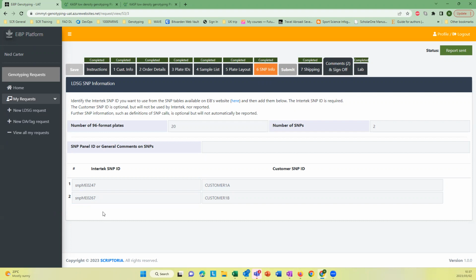But then in case of mid density, it will be difficult to upload the huge number. No, for mid density, you don't want to upload all the SNPs. You just want to select the mid density panel name so that the vendor will do the genotyping. Ying, you wanted to comment on the batch processing of the SNP ID?